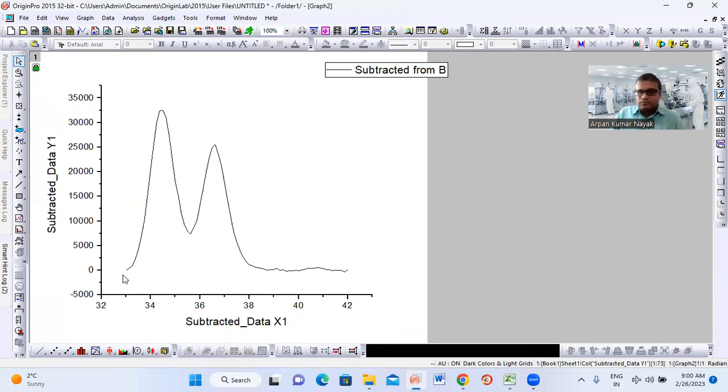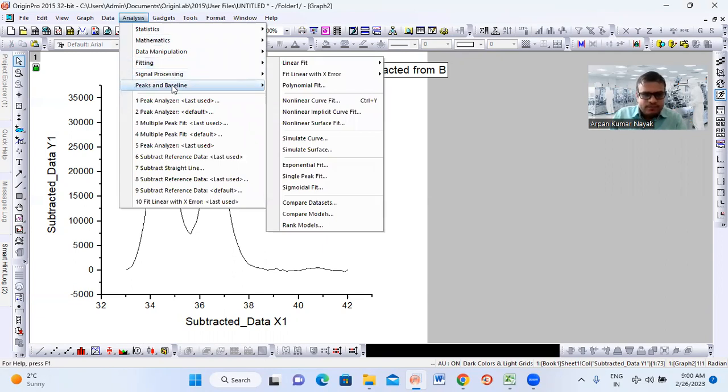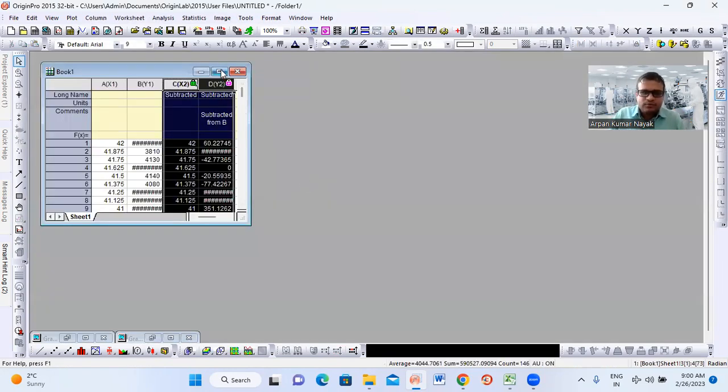Now I want to create a baseline here. So how can I create it? Either you can take it separately and plot it again and again try to create, or I can also make it here. So now if I want to create a baseline, I will try to create it from that. So what will I do now? Now you can see, I go for analysis. Again, I will go for, so better, because maybe you will face difficulties when you do it again, so better you do a new fresh window, then it will be more clear to all of you.